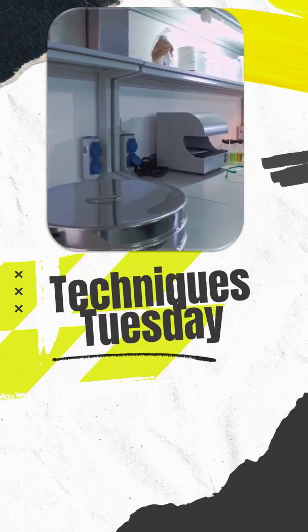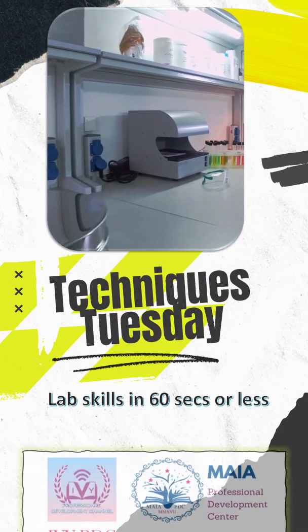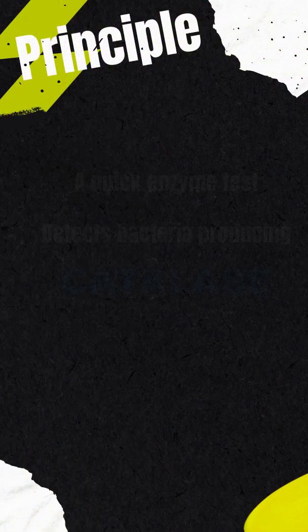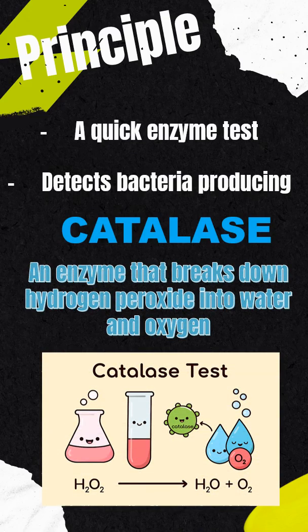Welcome to Techniques Tuesday — quick tips for sharper skills in the laboratory. Today's quick technique: the catalase test. The catalase test is a quick way to detect the enzyme produced by certain bacteria that breaks down hydrogen peroxide, releasing oxygen bubbles.